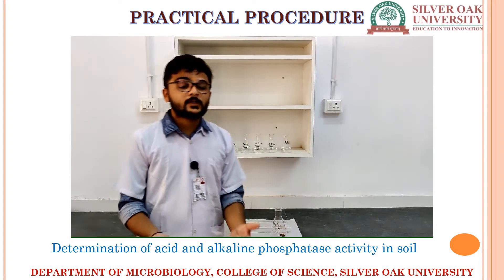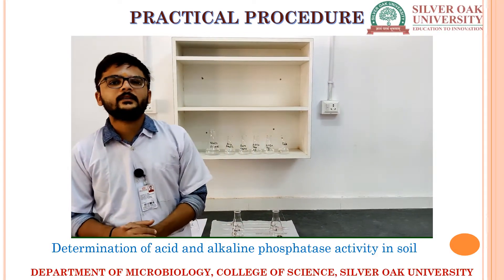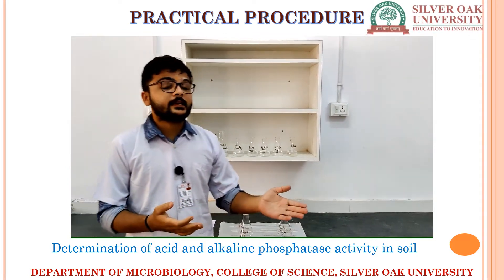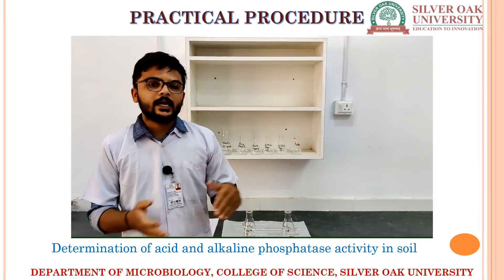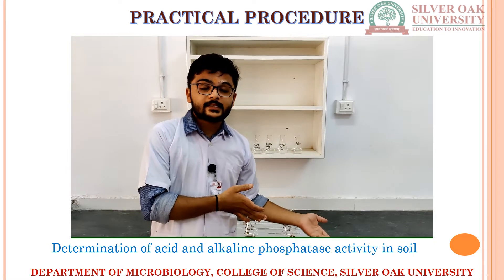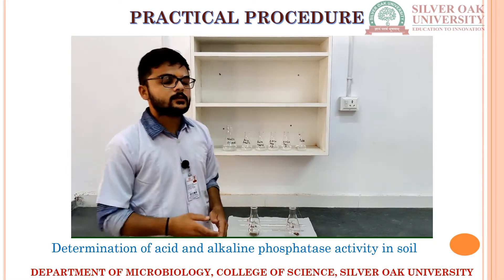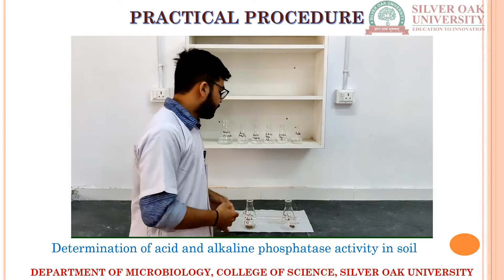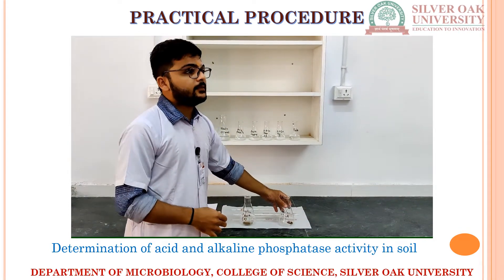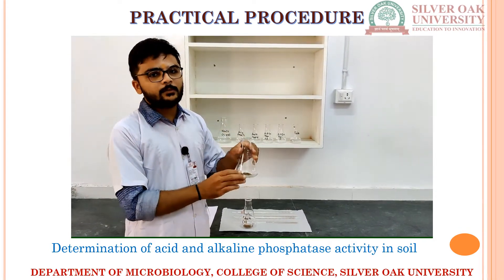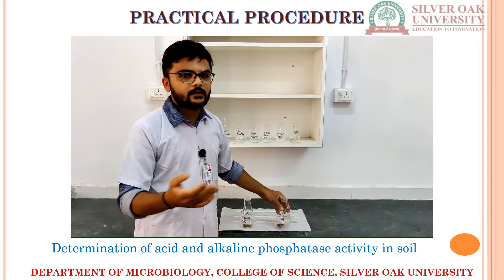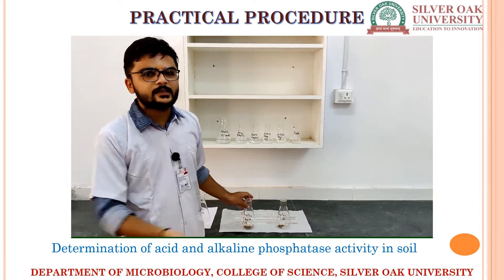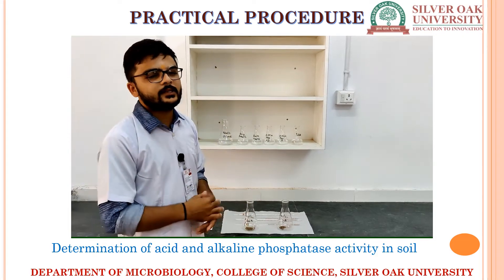For the procedure of checking phosphatase activity in the soil, we are analyzing two types of phosphatase activity: acidic phosphatase and alkaline phosphatase. We will create two systems for this, so we need two flasks. In each flask, we take 1 gram of soil. You can find soil from anywhere — from the rhizospheric area — and we just have to check the activity.